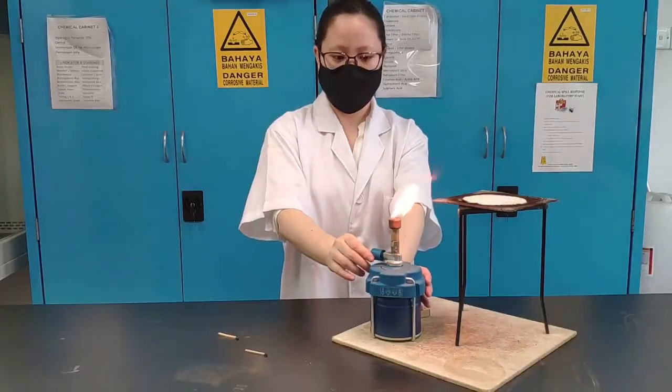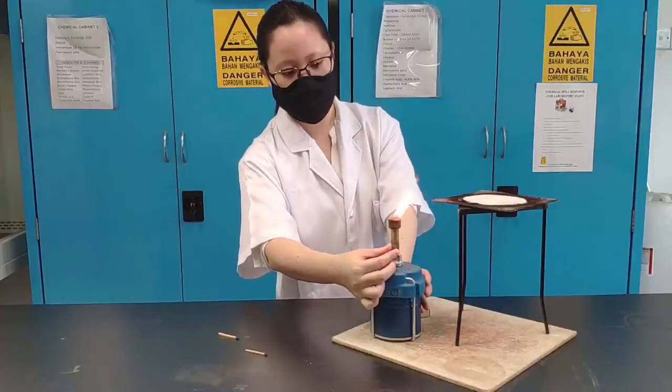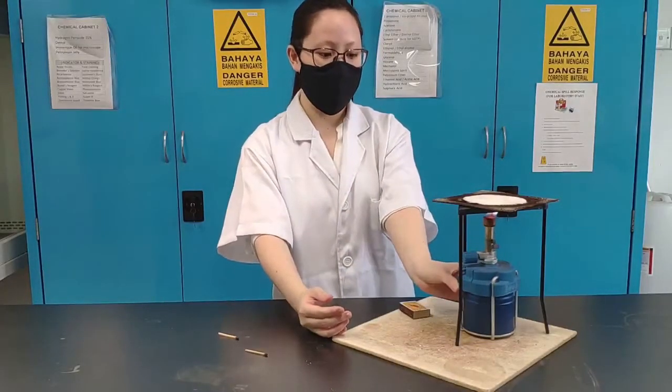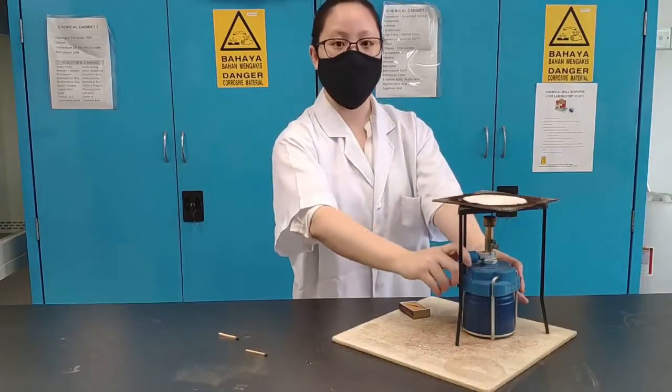Use your other hand to turn the knob simultaneously — do this quickly and as you can see the Bunsen burner will light up. You can then adjust the flame by adjusting the gas output and adjusting whether the air hole is closed or open, and then you're good to go.